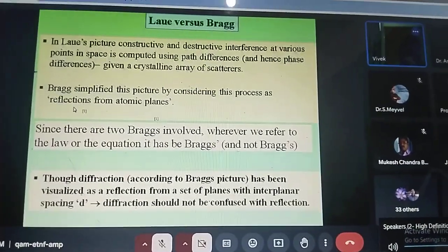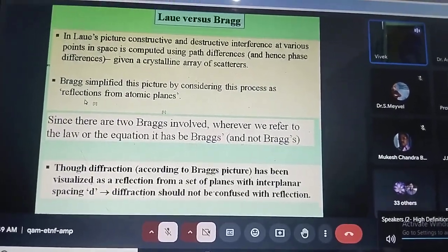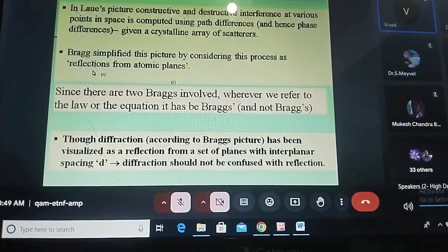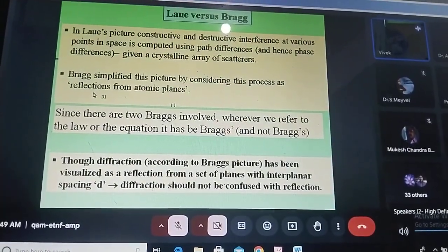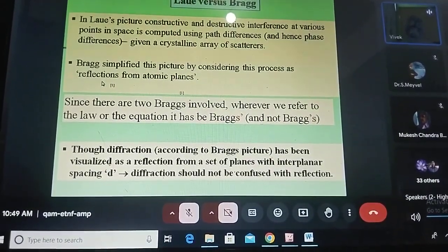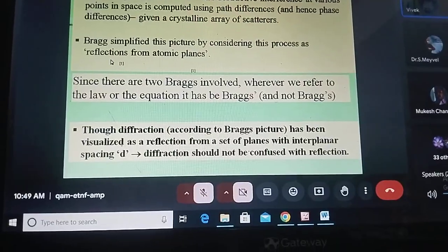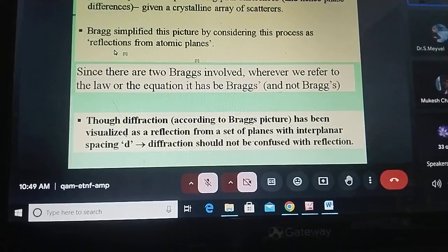So what I have noted: for 100, 300, 500 the intensity is 10, 20, 30. Wherever it is 200, 400, 600, the intensity is in the 1000s. So I have made out that even reflections are present, 200, 400, 600, and odd reflections are missing. This is from the data which I have collected. My output is from which plane I am getting what intensity. Nothing else will I get whenever I perform any crystallography experiment using X-rays on a single crystal.